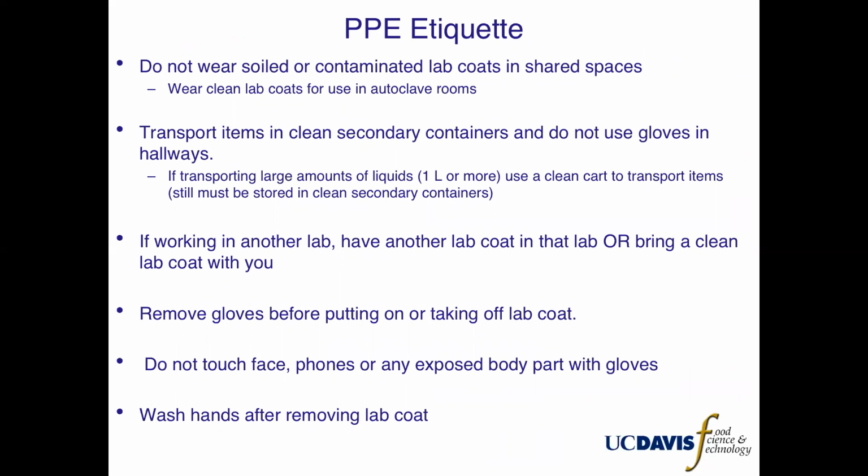If you are transporting something to a different location in the building, your items must be stored in clean secondary containers. Do not use gloves in hallways. If you are transporting large amounts of liquids, use a clean cart to transfer your items to avoid dropping and spilling. These items must still be stored in a secondary container.